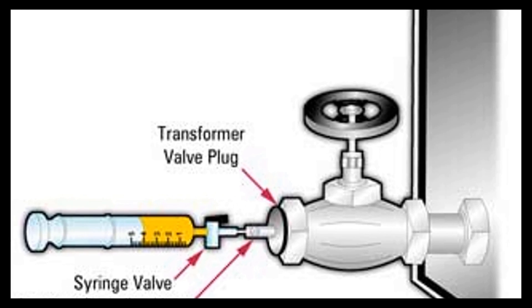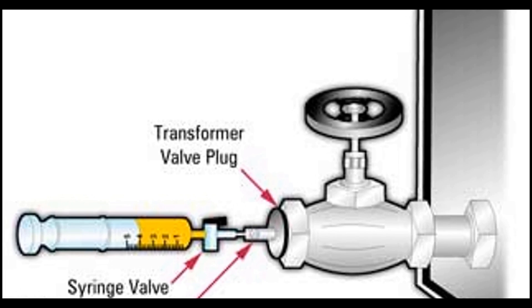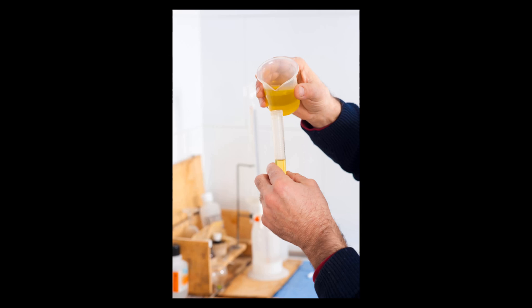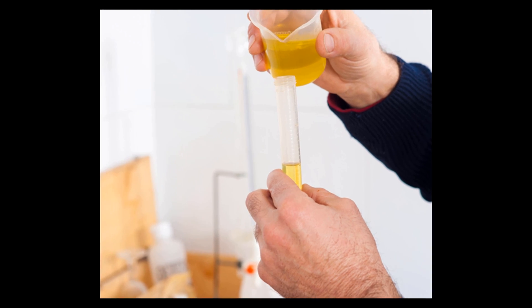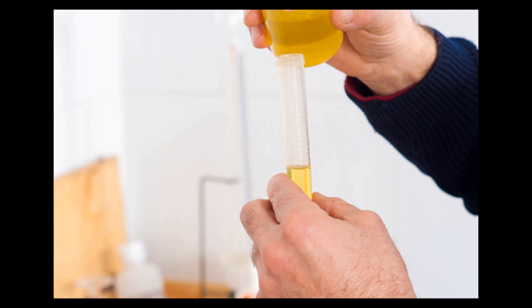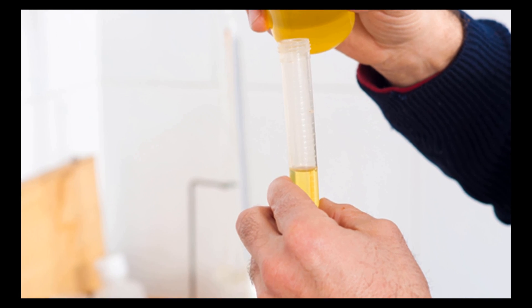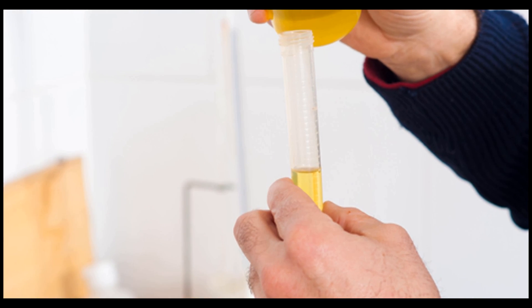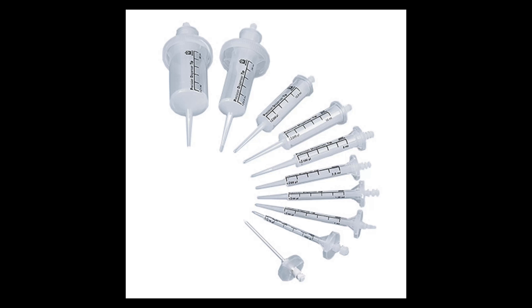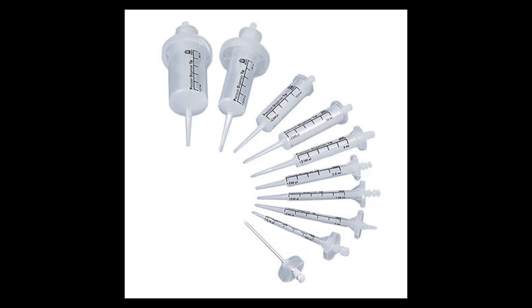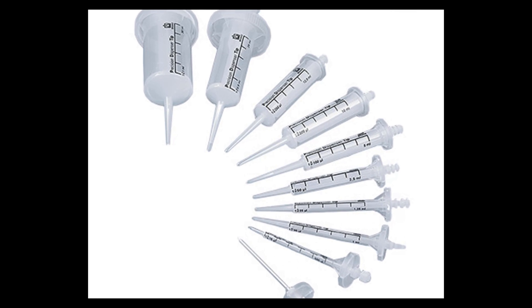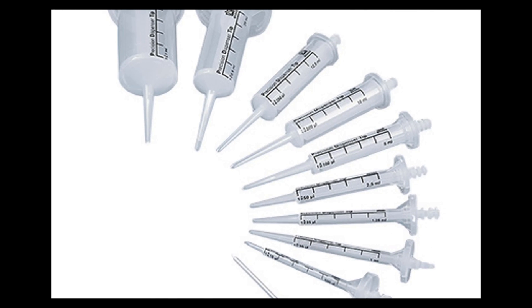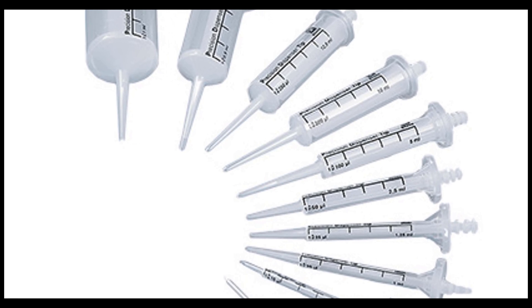Procedure of the acidity test for insulating oil: first, we take exactly 1 gram of insulating oil. We normally do this by taking 1.1 milliliters of the oil to be tested using a provided volumetric syringe, since 1.1 milliliters of oil is taken as equivalent to 1 gram of oil.